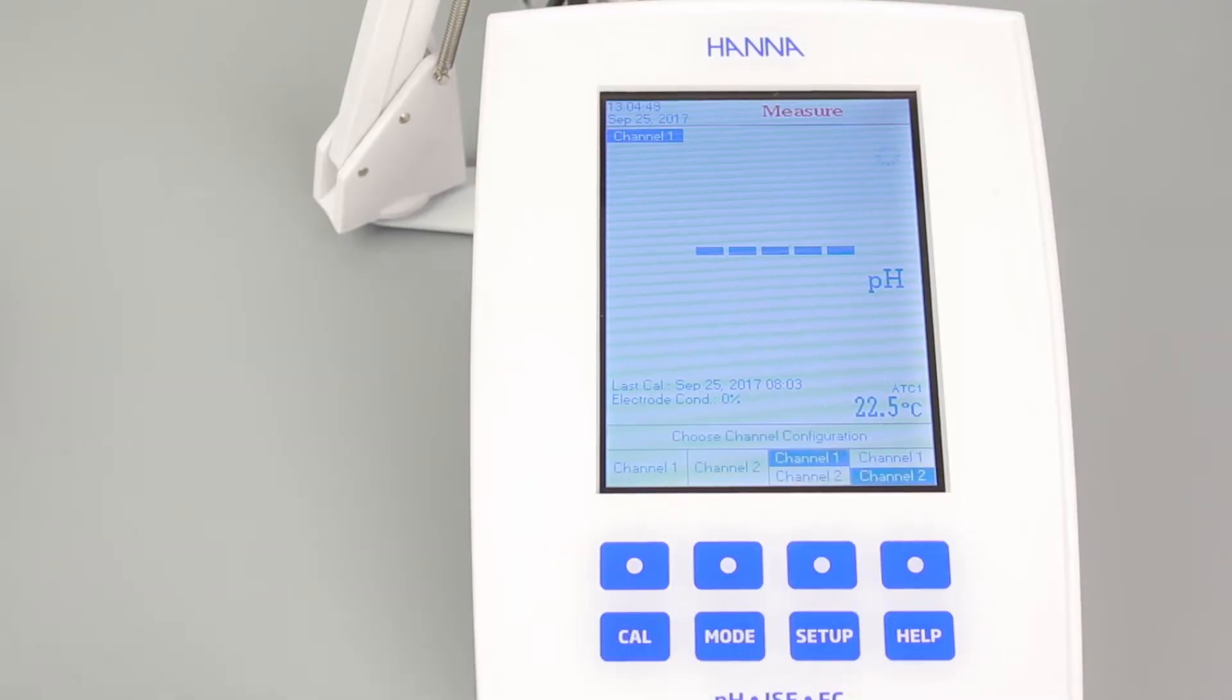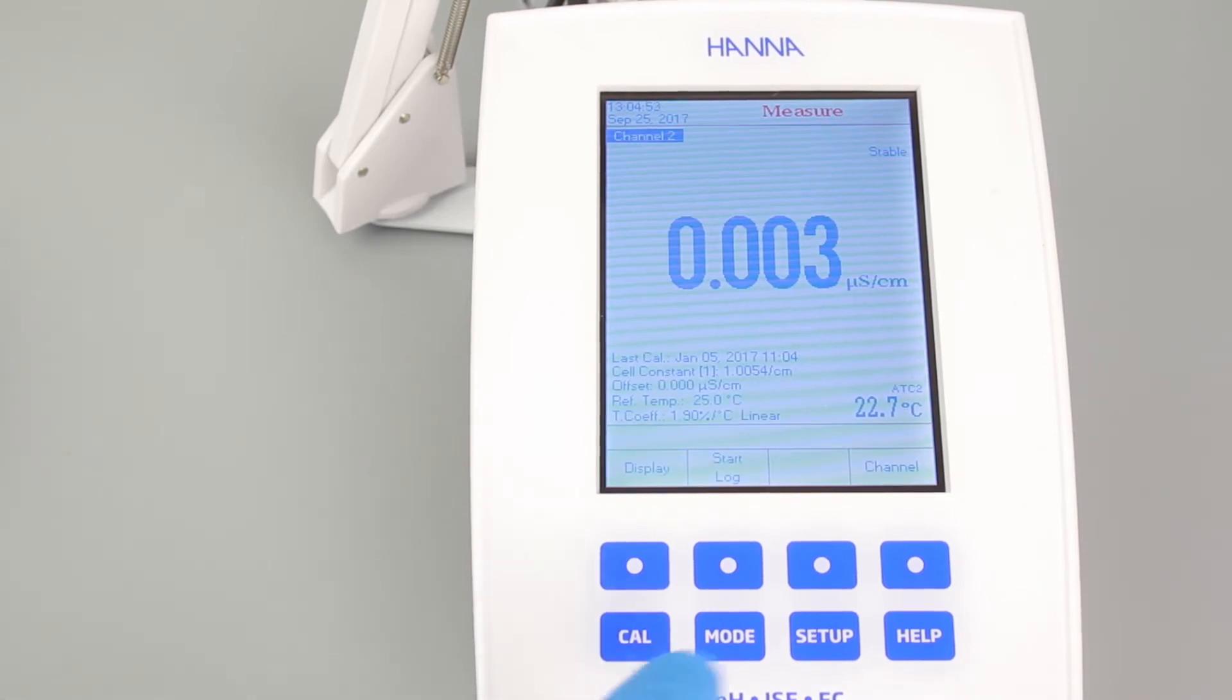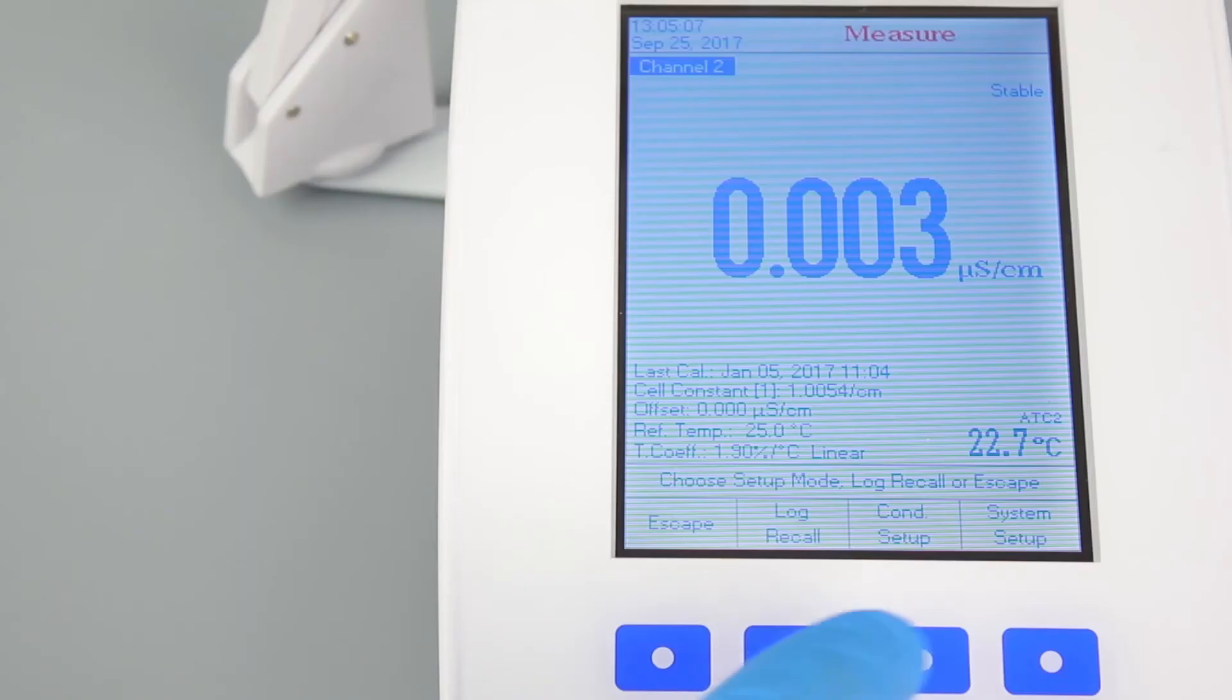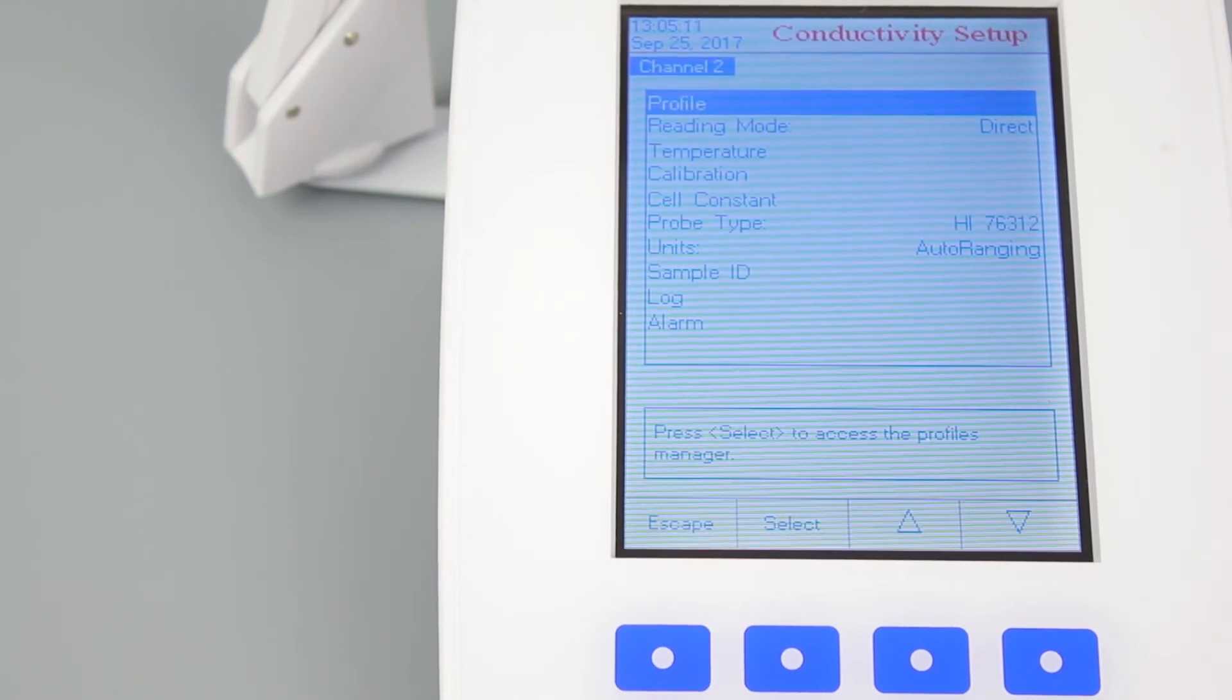You can also view the conductivity setup by selecting the appropriate channel and going into the setup. You will find everything you need to customize your measurements here. With all the options to choose from, I really recommend going through each setting to determine what will be best for you. Once complete, you're ready to begin calibrating your meter.